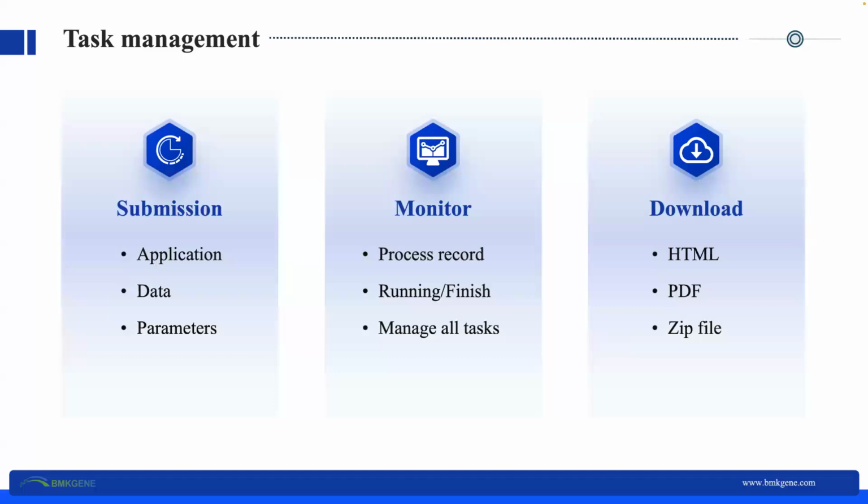Let's summarize here. We talked about submitting an analysis using BMKCloud. We choose Amplicon applications. You can choose the applications you need, select the data in BMKCloud, and set analysis parameters. All the applications in BMKCloud are used in this way.